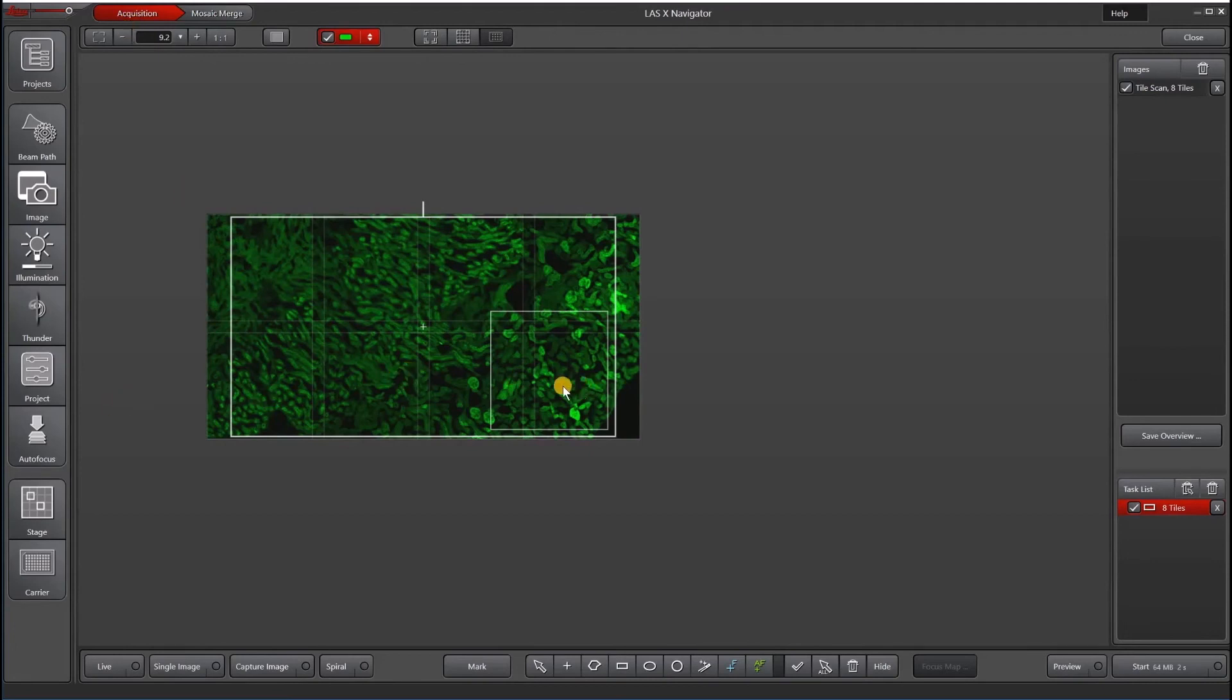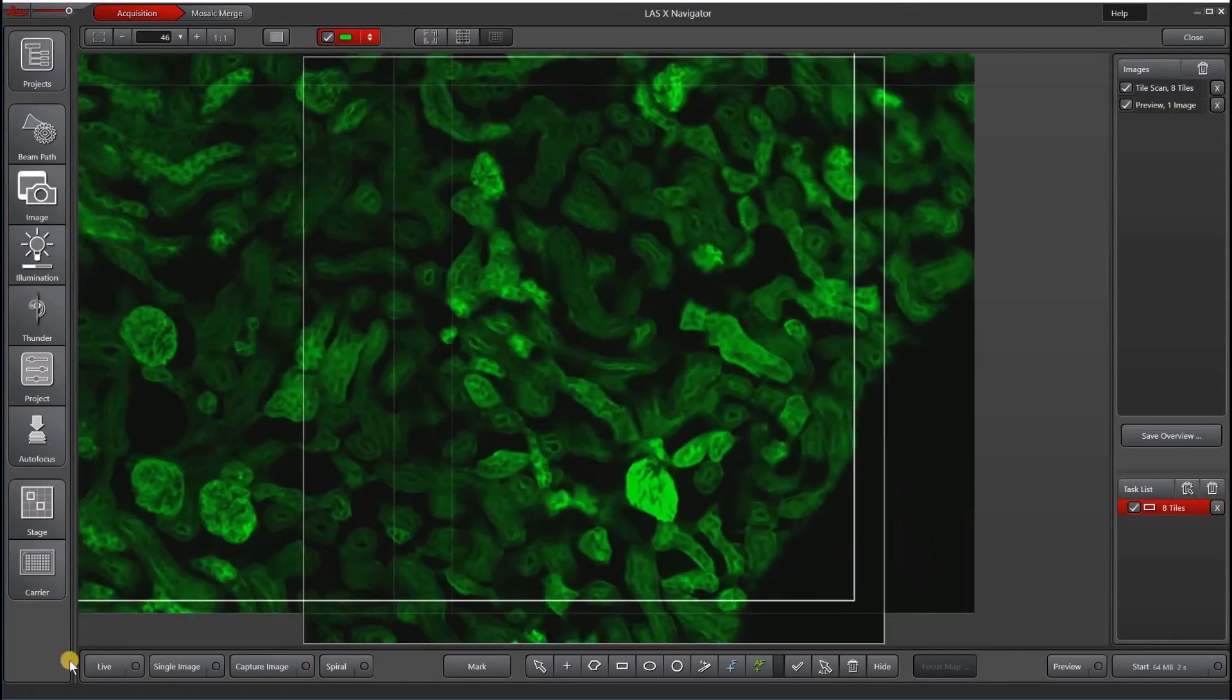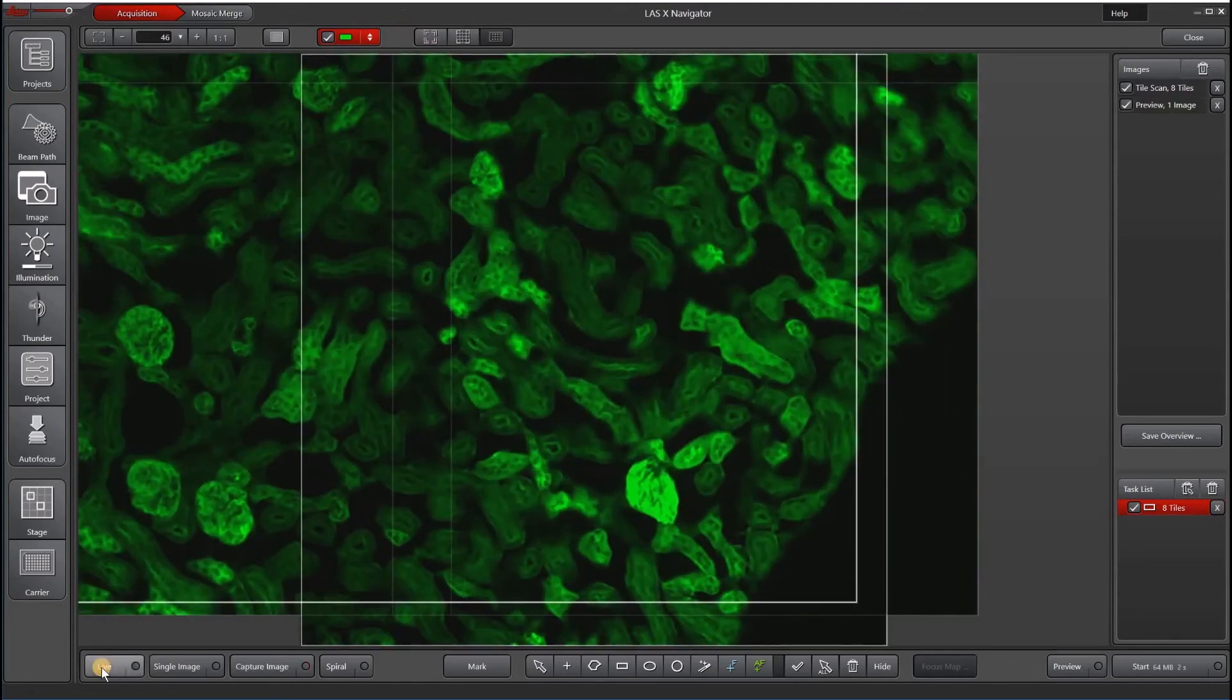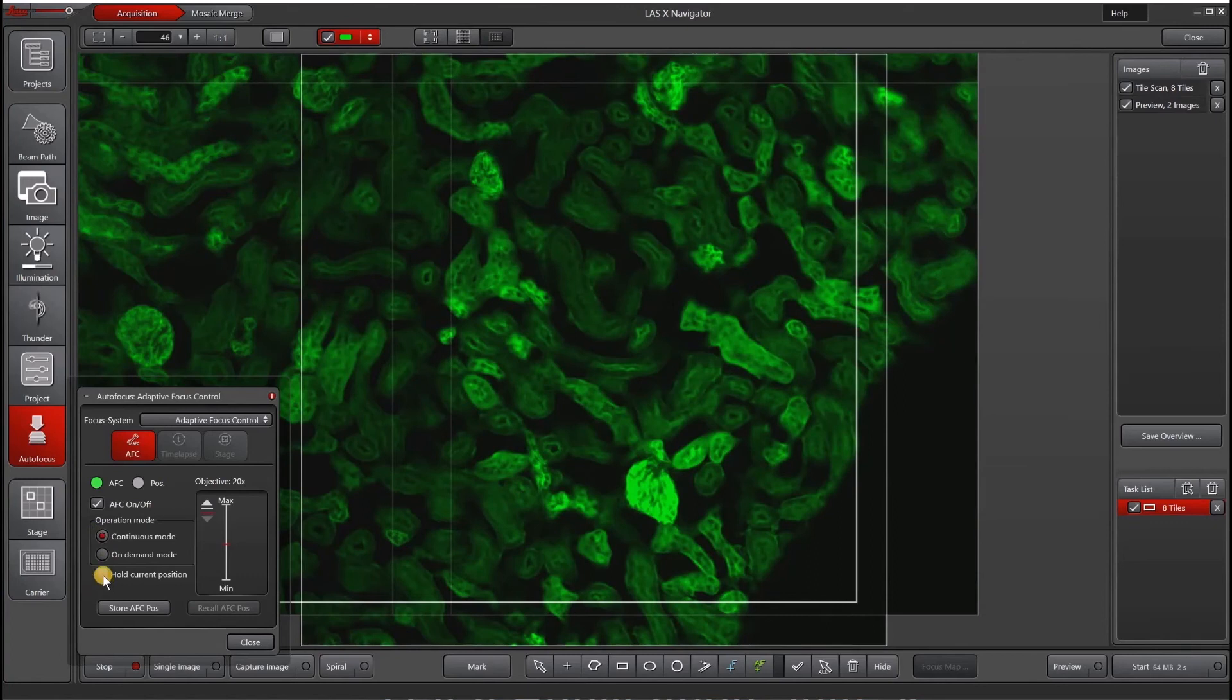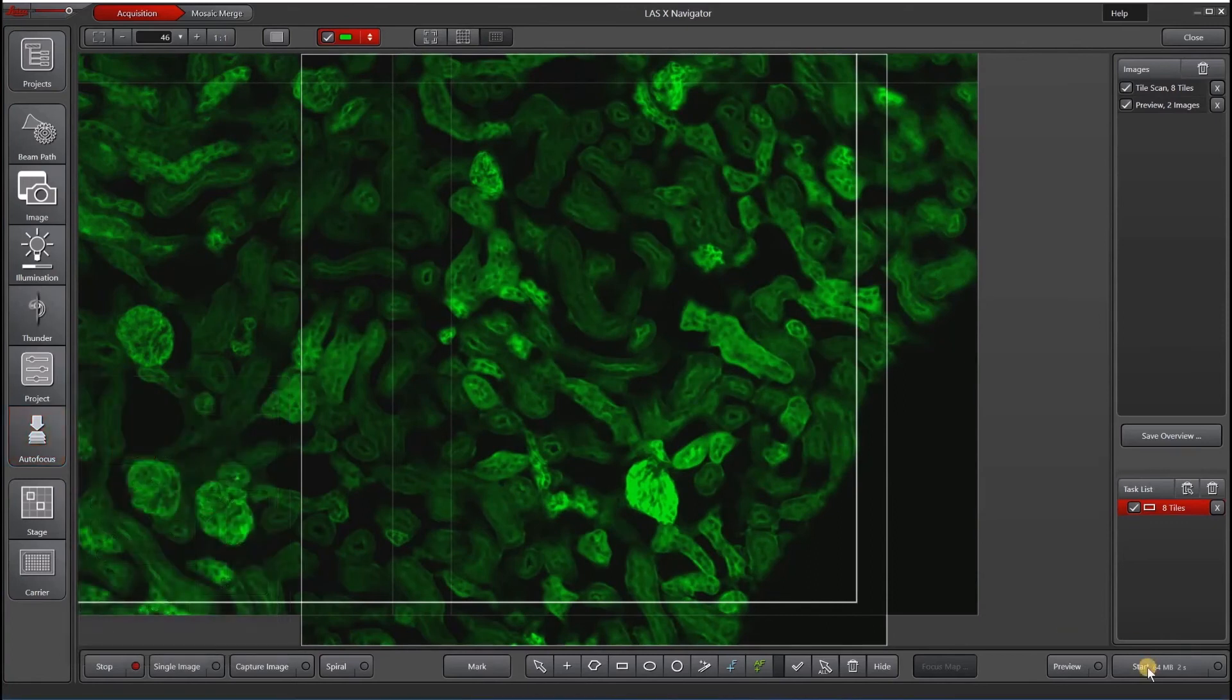To do that, I want to go live, and then I'll go to my autofocus panel, choose continuous mode, focus, and then select hold current position. Then I will start my experiment.